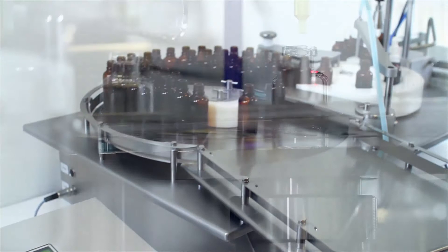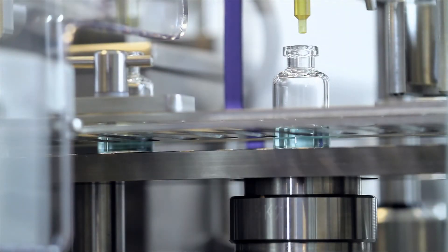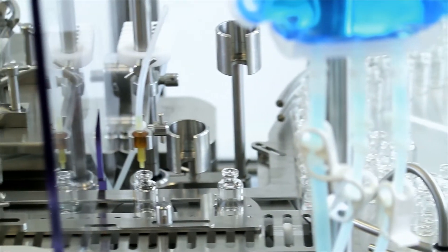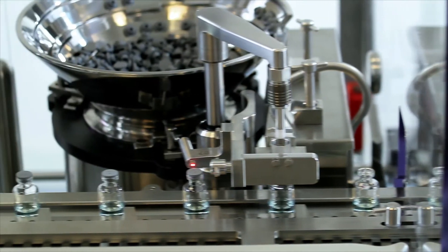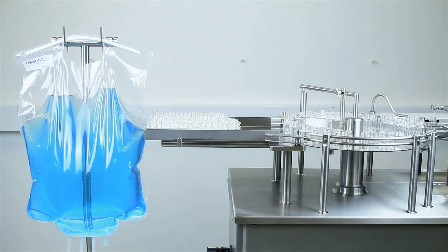Single-use systems transform the way a filling line is used. Systems are kept clean and free from contamination, eliminating the need for cleaning validation.